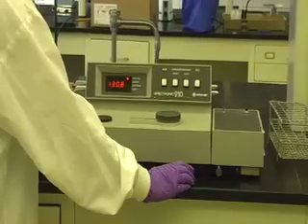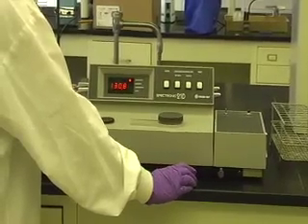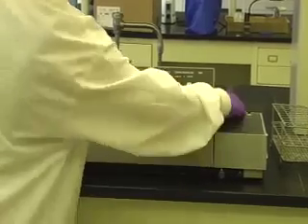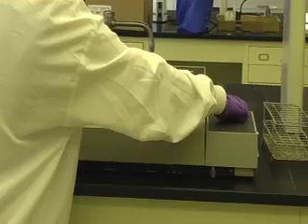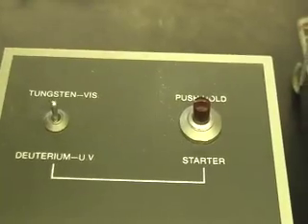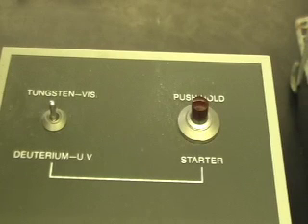To select the lamp, flip the lamp power switch to tungsten VIS or deuterium UV. The lamp power switch is on the right side of the machine. When using UV, press the starter button next to the lamp power switch to ignite the lamp. The deuterium lamp requires at least 10 minutes to warm up.